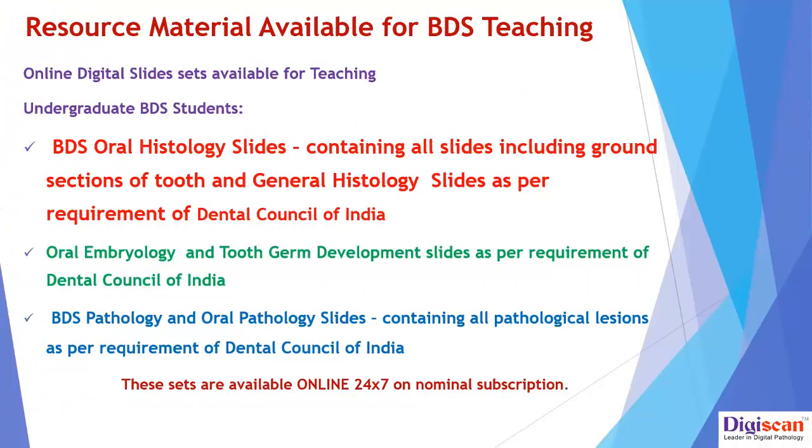Resource material available for BDS teaching is as follows. Oral histology slides, which contain all slides including ground sections of tooth and general histology slides as per requirement of Dental Council of India.